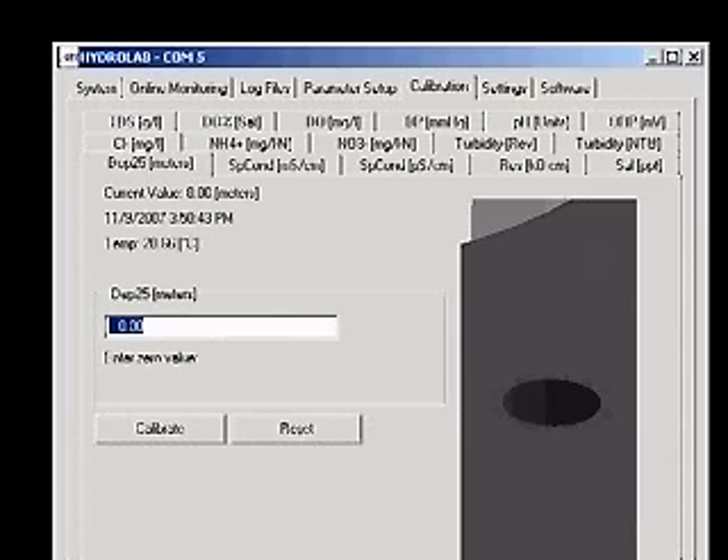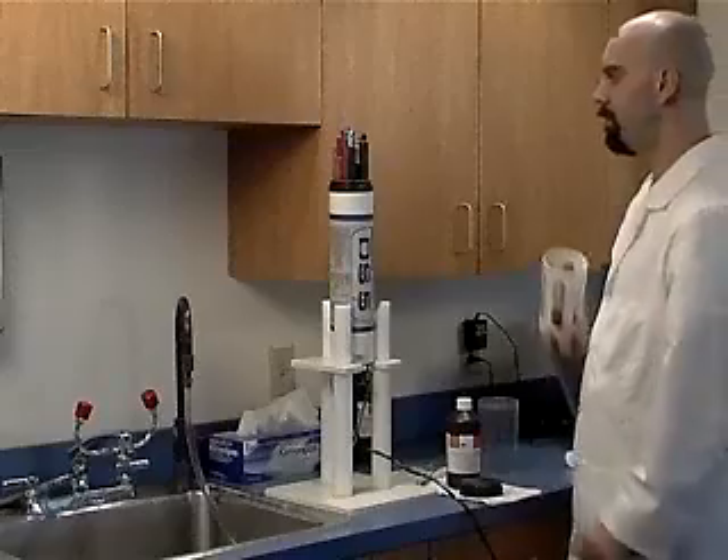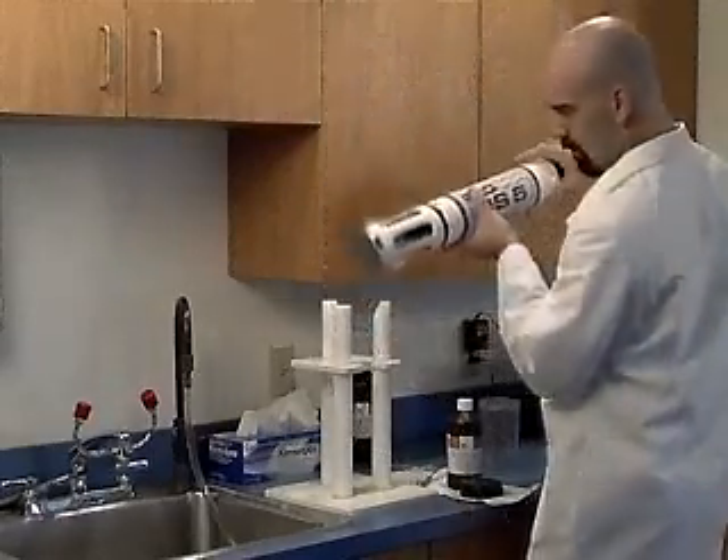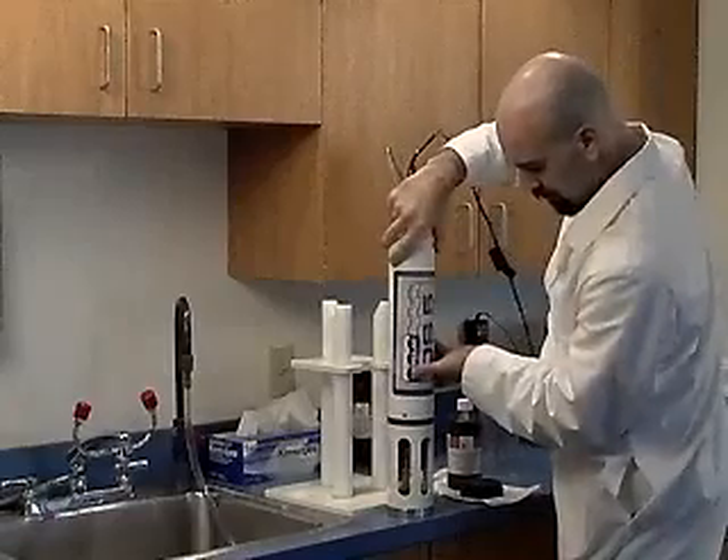You will see a picture of the opening in the sonde as well as the current depth in meters, the date and time, and the current temperature. Remove the storage cup and attach the weighted sensor guard. Turn the sonde over so the weighted sensor guard is pointed down.